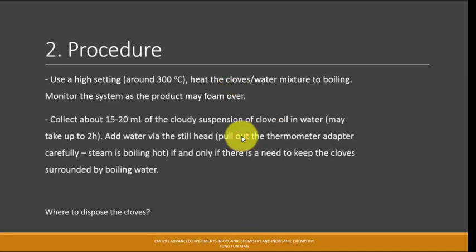Okay, so as the reaction progresses, you also need to collect your product, about 15 to 20 ml of the cloudy suspension that contains your clove oil in water. Take note, what you collect here is not pure. It is a mixture of clove oil in water.